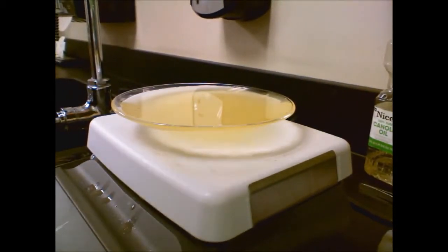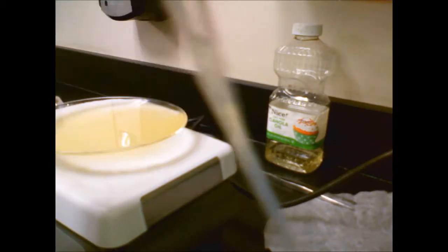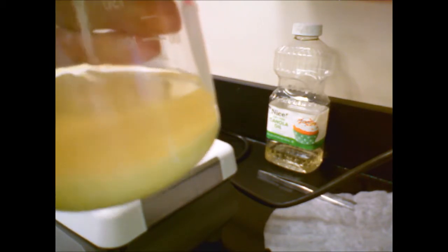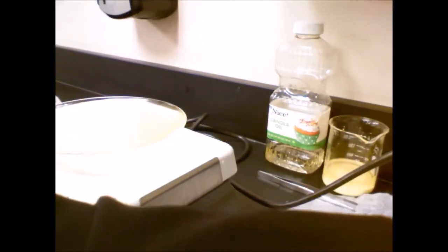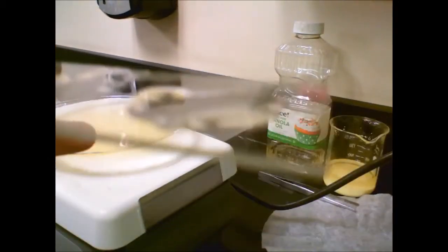And actually, as an afterthought, I'm going to let you watch me do this. I'm going to take some of the extra solution. You can see we definitely have some extra. And I've got a little pipette here. I'm going to take just a little bit of this. Oh, got a little bit of the dust in the bottom there. And I'm going to add this to the plate that I showed you earlier, and specifically that part in the middle where I have my largest crystals.